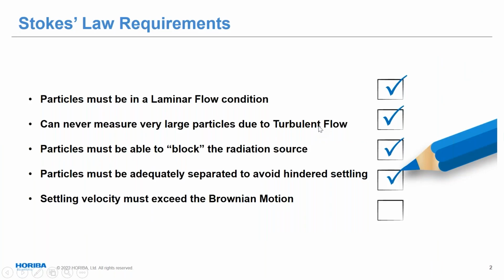Okay, now when we talk about Stokes' Law, we have certain restrictions on where this will be operative. We're going to show you the equations in a moment, and they are really quite straightforward, nothing particularly exciting about them, but in the background, you have to remember that the conditions on this slide have to be met. As we do the measurement for sedimentation, we've got to have laminar flow, either downward sedimentation, or creaming if you're dealing with emulsions or things like that. You cannot work at all with very large particles. They will always be in a turbulent flow situation, and so these equations will not be applicable.